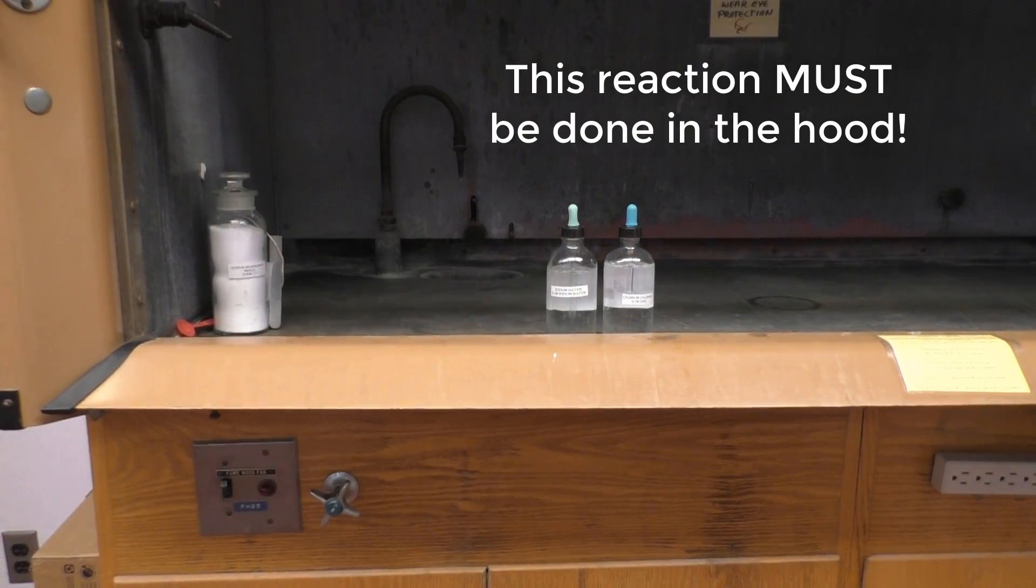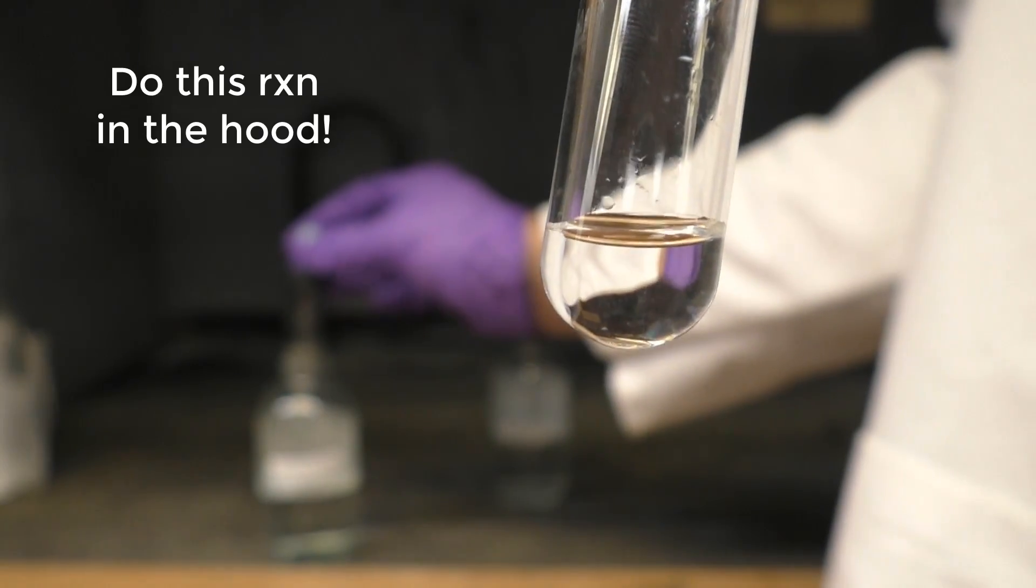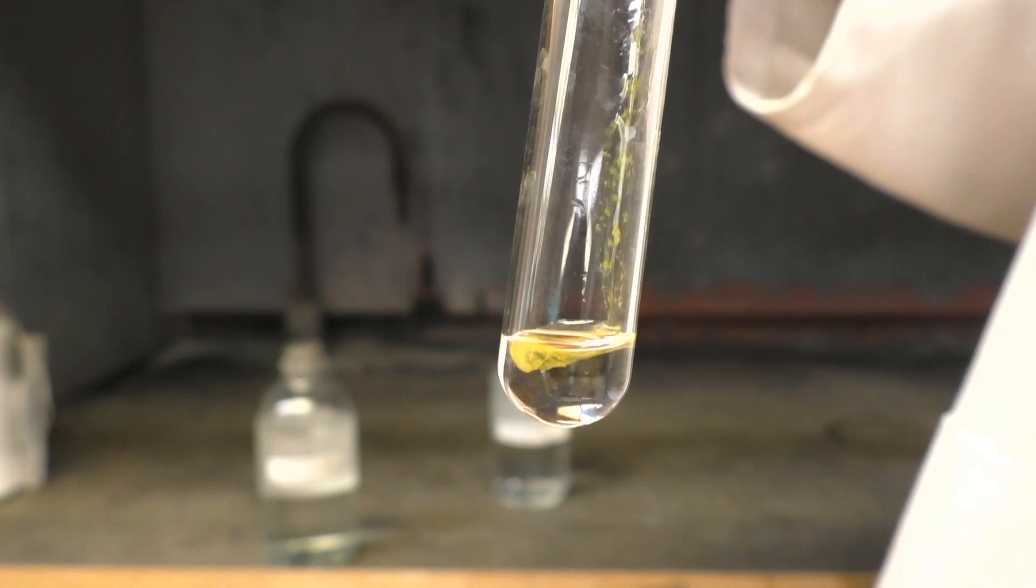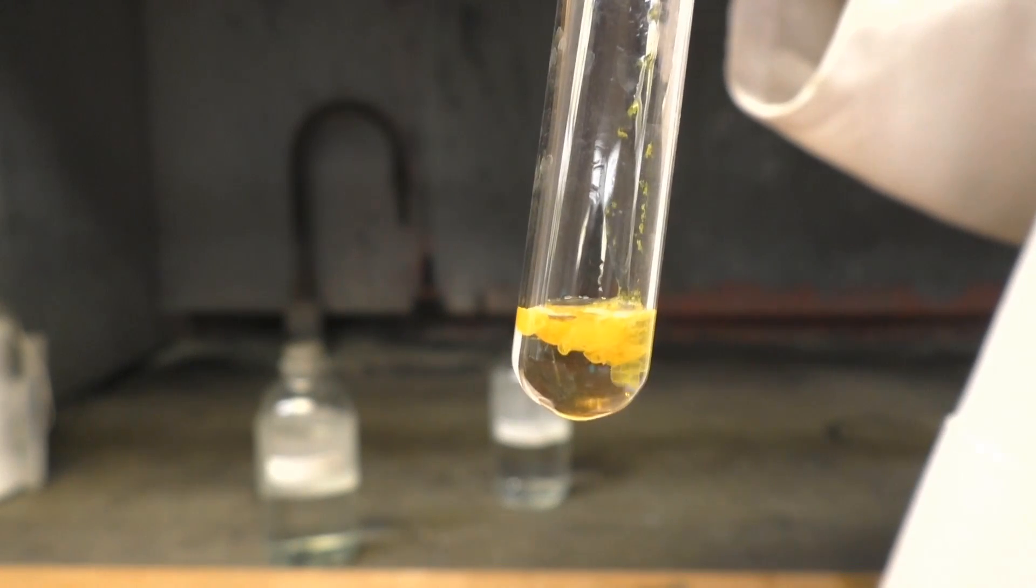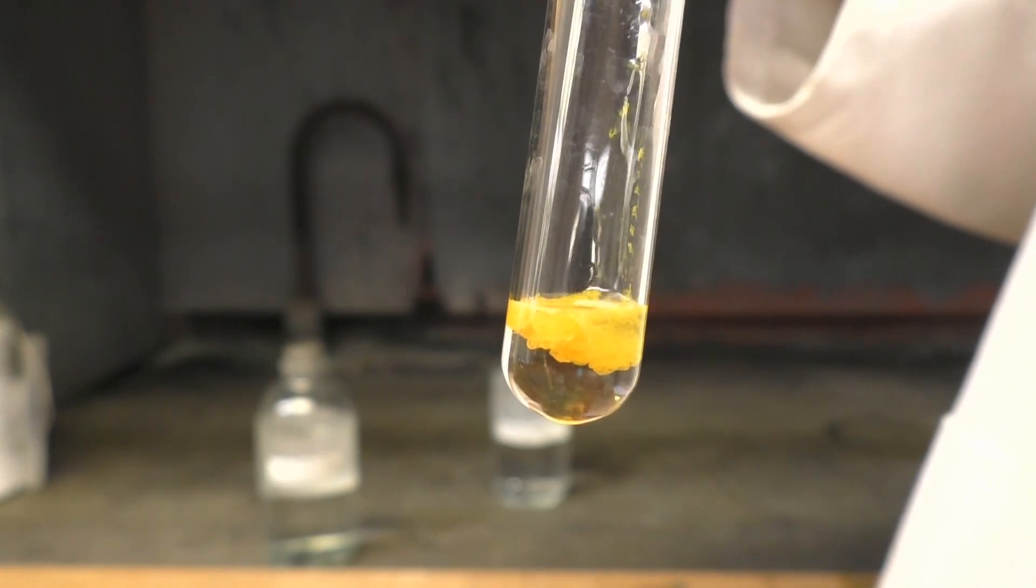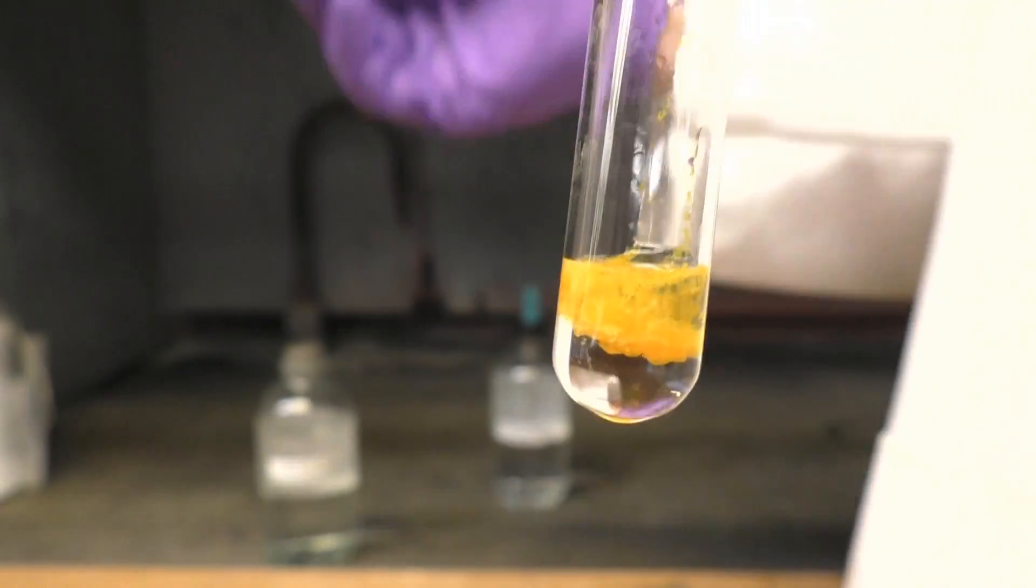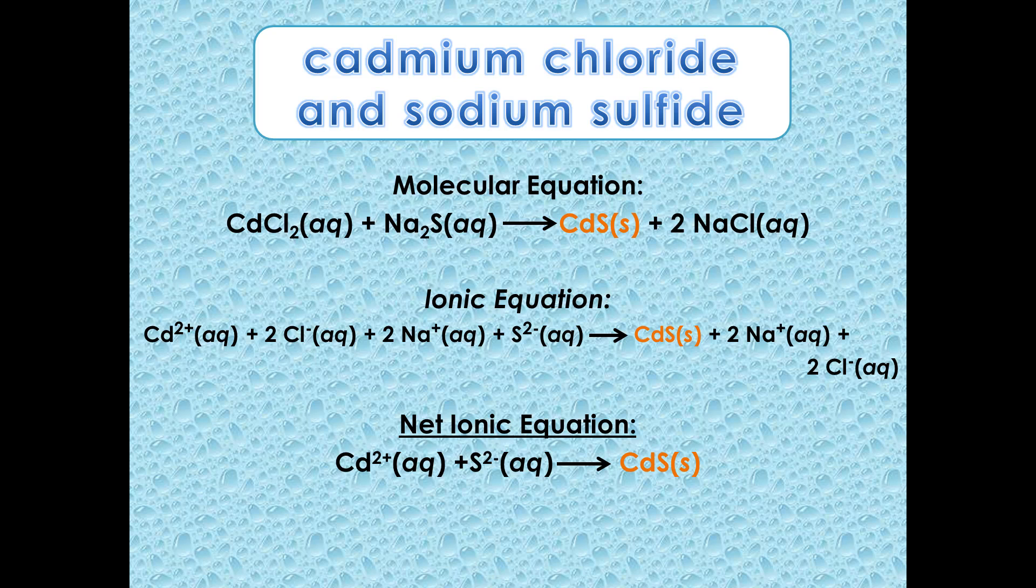Our last demo is the precipitation reaction between cadmium chloride and sodium sulfide. Look at how the tube becomes cloudy as we add the second reagent. This is the formation of the precipitate or solid product. So what compound is that product? Once again, writing out the molecular, ionic, and net ionic equations for cadmium chloride reacting with sodium sulfide shows the formation of solid cadmium sulfide, CDS.